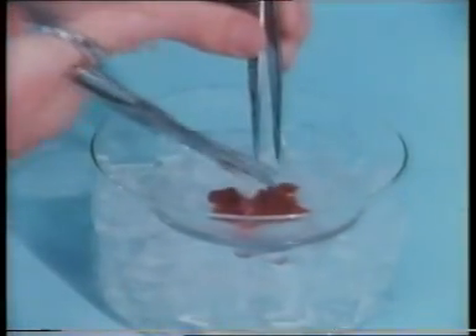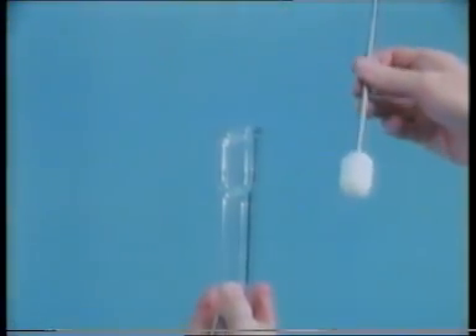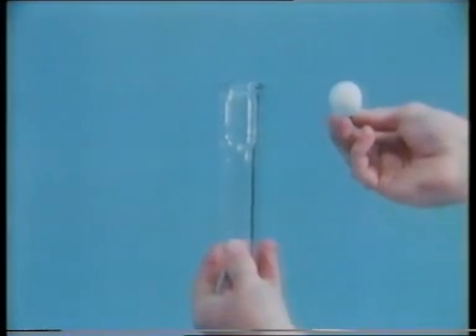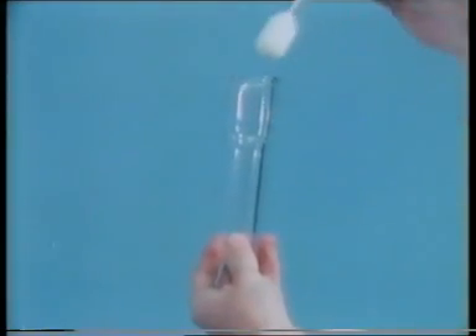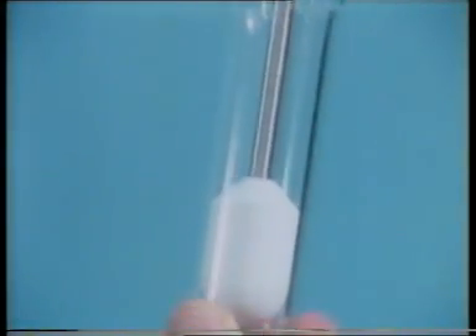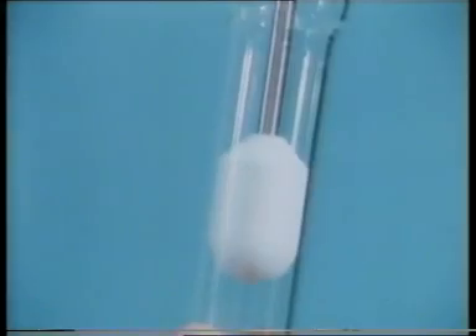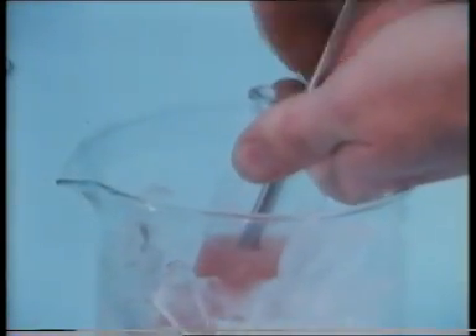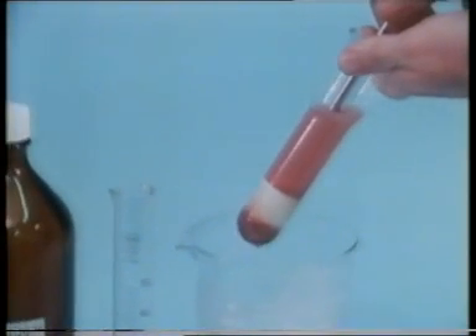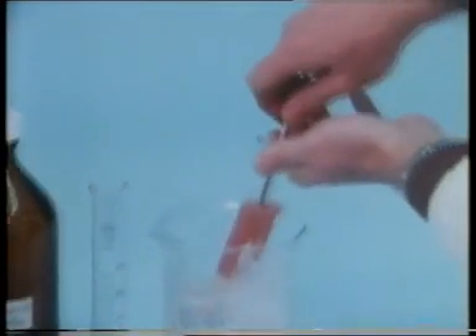Now it's chopped up, and the cells are then ruptured and the organelles released using this homogenizer. The plastic pestle has grooves at the bottom and fits tightly into the glass tube. When it's moved up and down and rotated, organelles from the cells, including the mitochondria, are released into the sucrose solution at the top. A measured volume of sucrose solution is used, corresponding to five times the original weight of the liver.